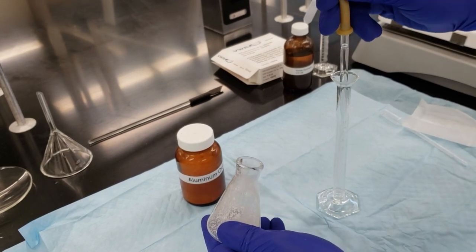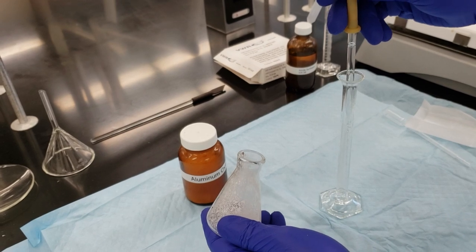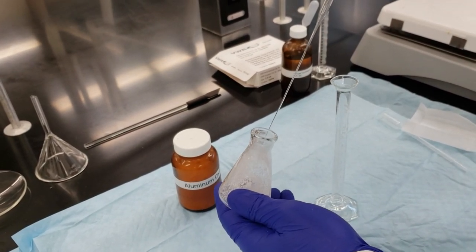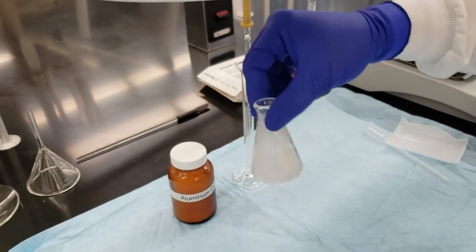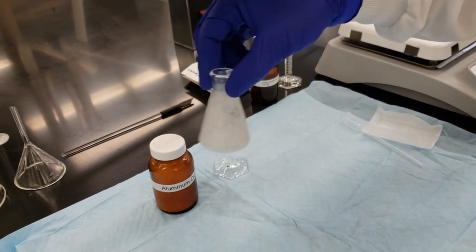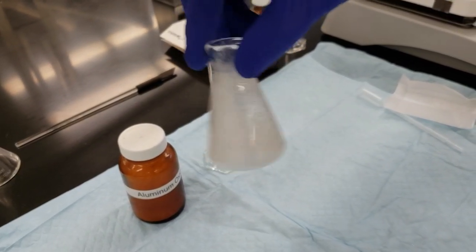And that should be the last drop. Yeah, we got a tiny bit more of our acetic anhydride. I'm going to swirl this flask for the next 10 minutes to make sure that our reaction goes to completion. And we'll check back in for the extraction process.